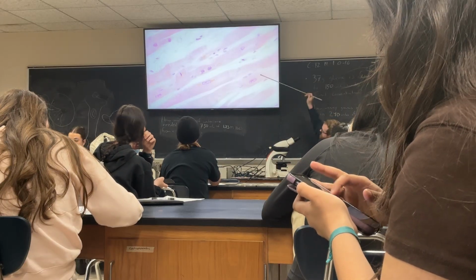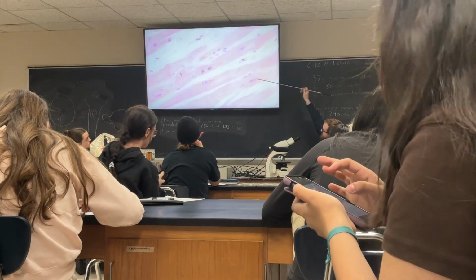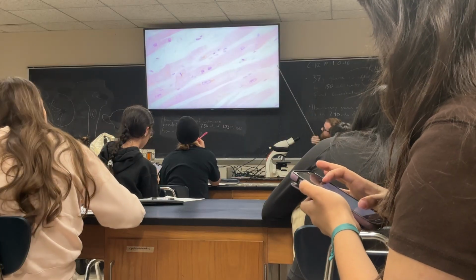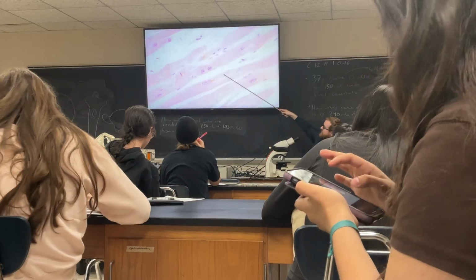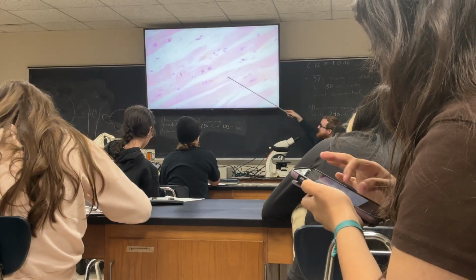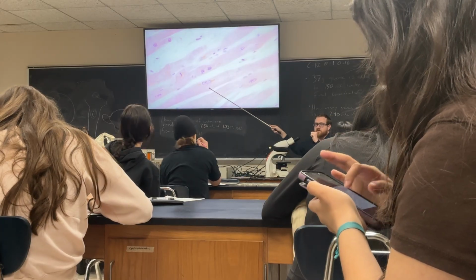And you can even see, if you're close enough to me, it's almost yellow, but there's a little faint area here, a fainter area there. Over here you can see it's yellow for some reason on either side. That's because all the proteins that make up those sarcomeres, that make up the striations that you normally see, are being forced around the nucleus, because the nucleus is in the middle of that cell.